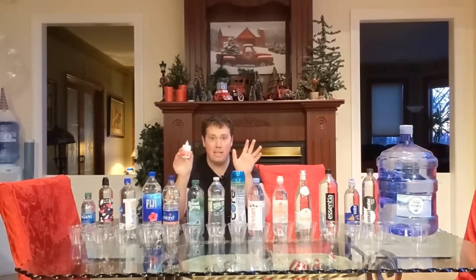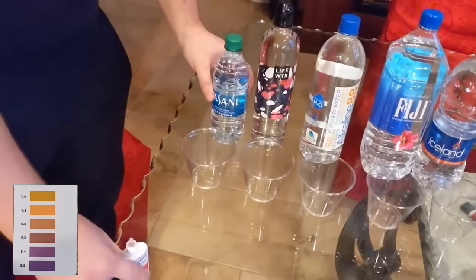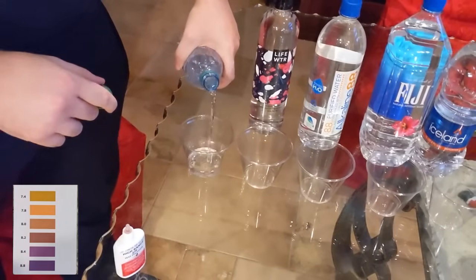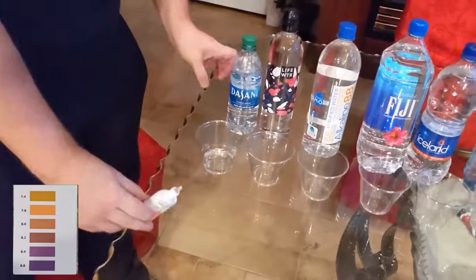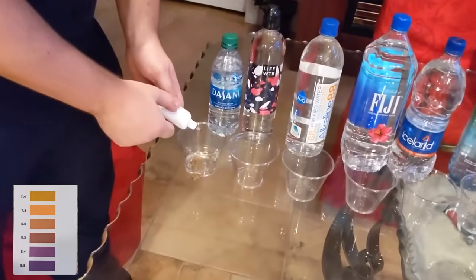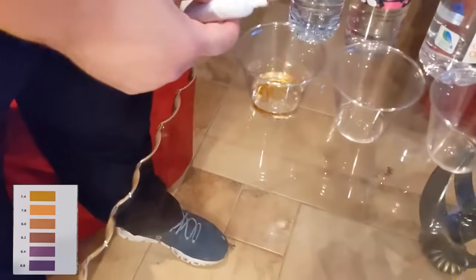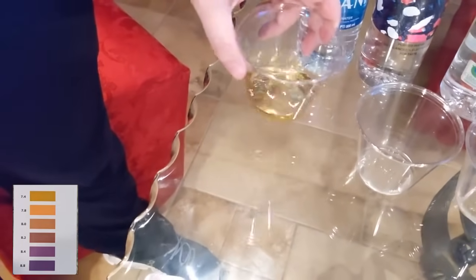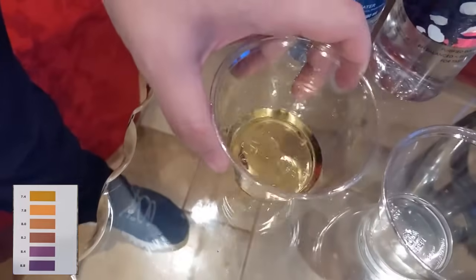We've landed here and we're going to test the pH of all of my competition. So here we're looking at Dasani. Let's pour this and take a look at the pH — a couple yellow, acidic. Really not necessarily where you want to be if you're looking for alkaline water.